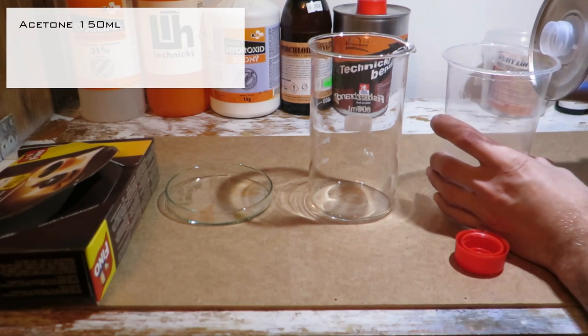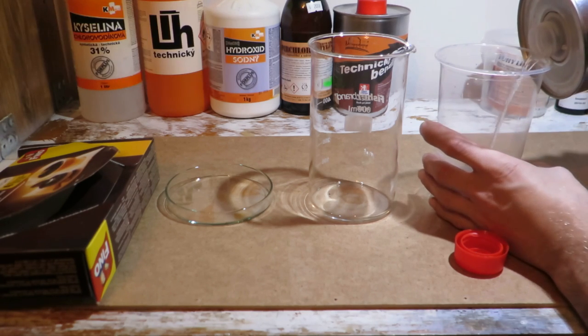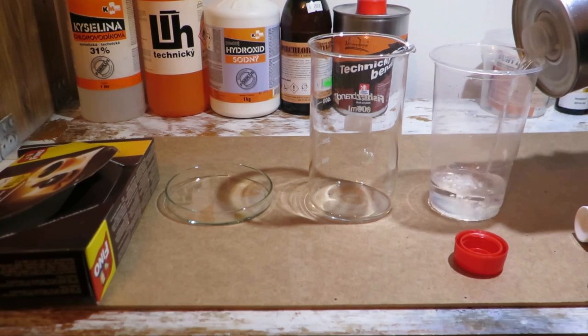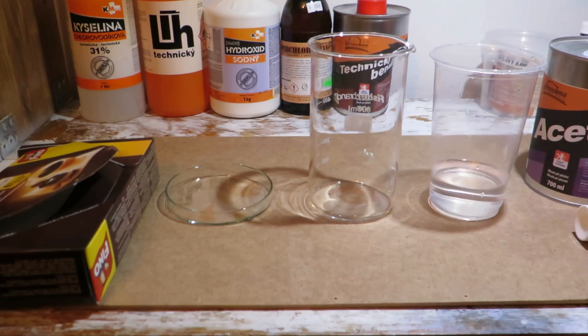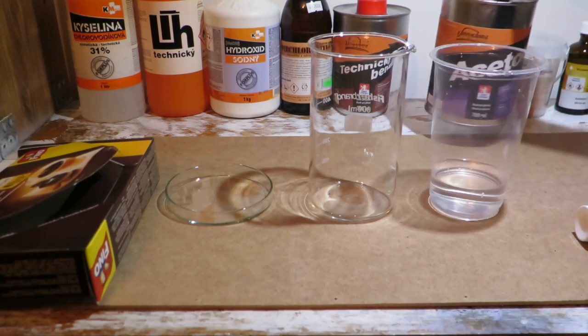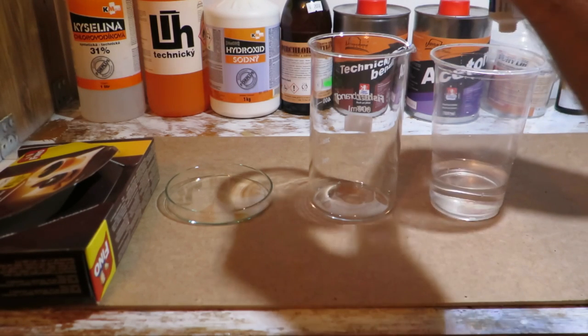We start by adding 150ml of acetone into a disposable plastic cup to dissolve BP from the product. Next add contents of the cream to the acetone.